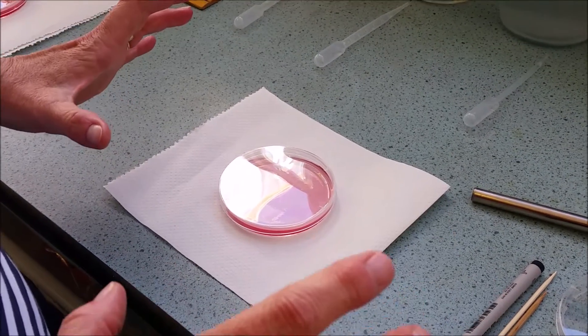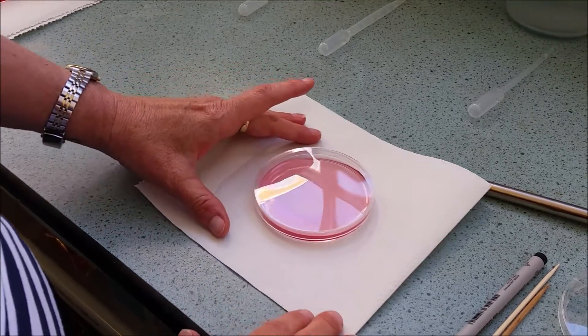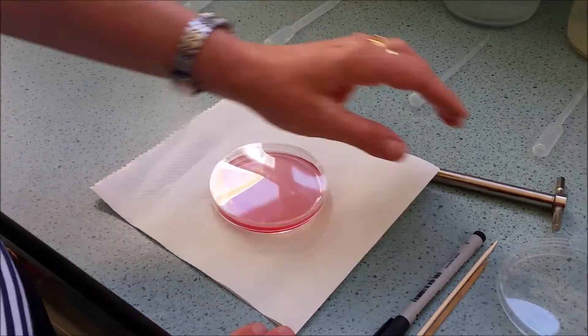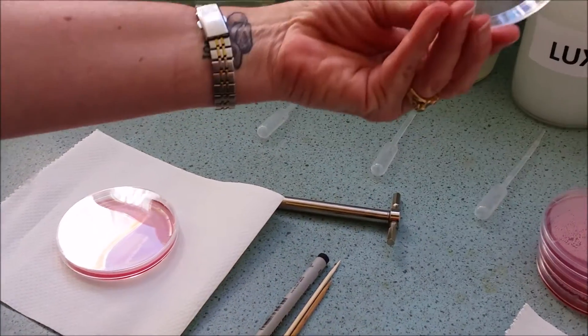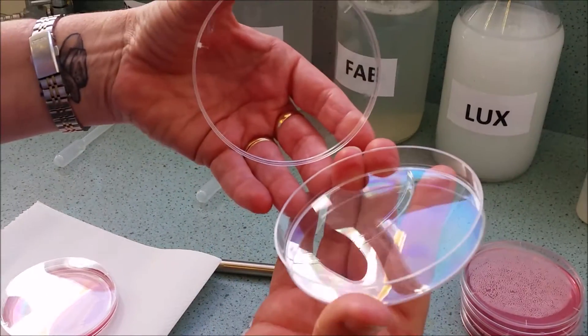This is our prac method that you'll be using. You'll be collecting two petri dishes. When they're empty they look like this. It's just a lid and a bottom to it.